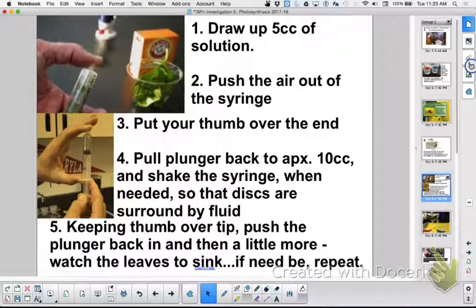Now, I had to replace a couple light bulbs, and I want to tell you, I think the round standard light bulbs work better than these spirally ones. So if you want to, you can huddle around just the good smooth bulbs and not the spirally ones. I don't know if they're generating enough energy, those spirally ones. Do you see how we're introducing another variable by having two different light bulbs? So as a result of that, I would just share with the other team and set up a little station.